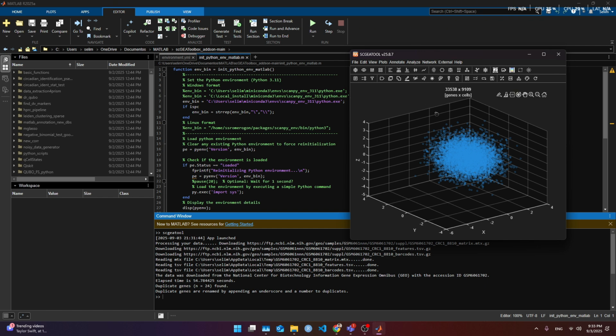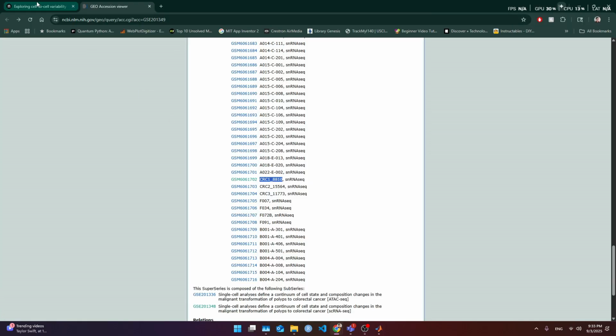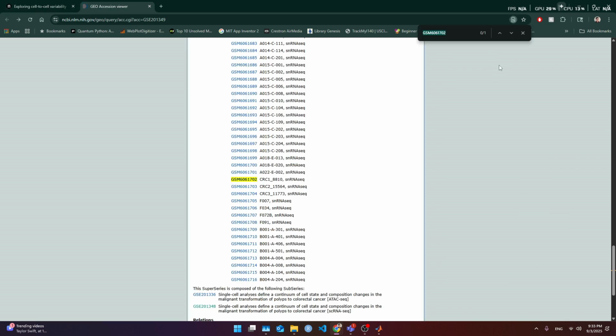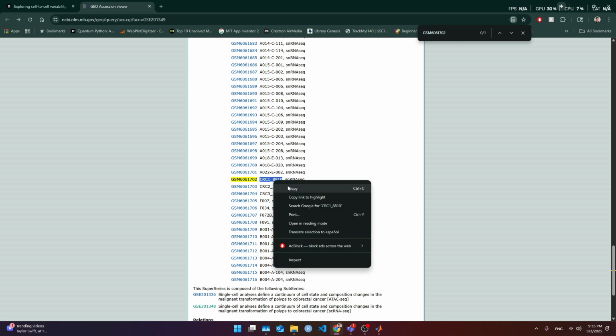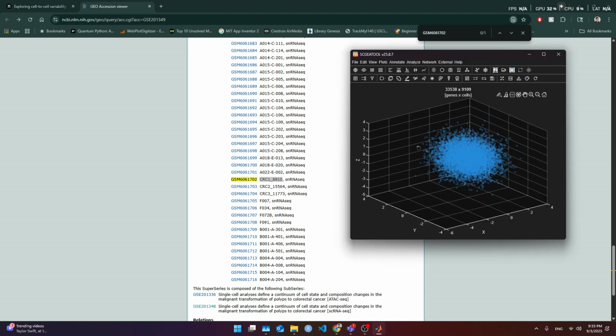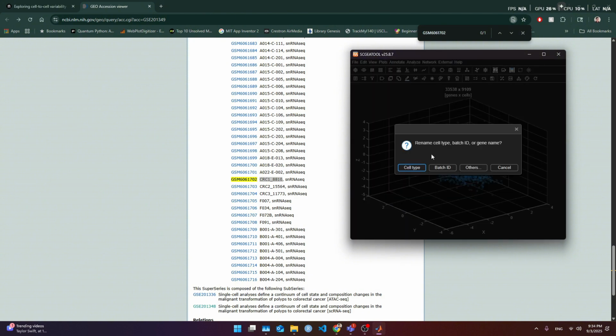So this is the first data set. And then here we're gonna do the first thing, come back, and as I mentioned, we downloaded this. We come back here, we make sure that's here. So we're gonna grab this as the sample name, and we're gonna assign that. So what we do is here in this pane, and then we're gonna rename cell type, batch ID, or gene name.